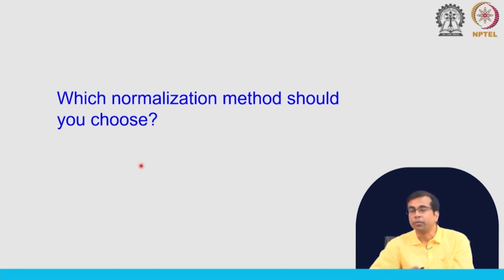But if you want to do between sample comparison only, then you have to choose a proper method that will be able to handle this RNA composition bias across samples and also look at differences in other factors, so it can model all this technical variation. So, you would have to choose something like that. But if you want to do both, then you probably have to combine some of these methods one after another.